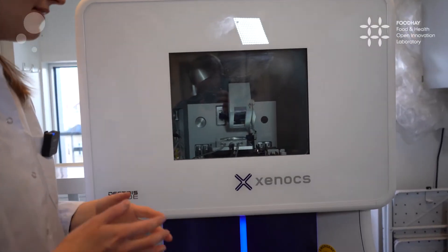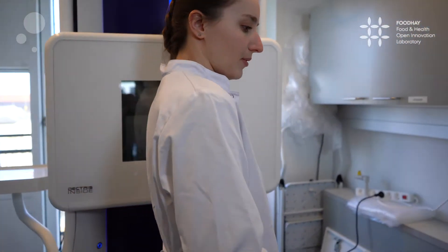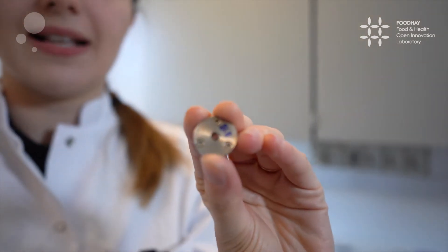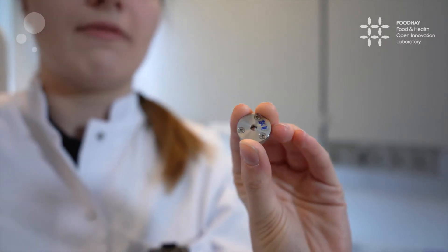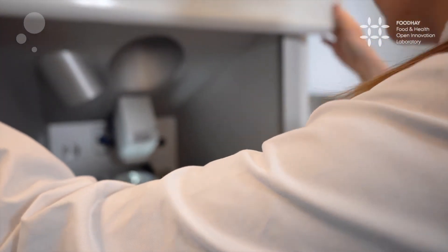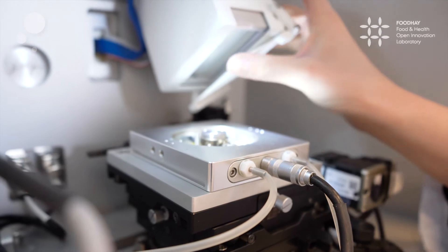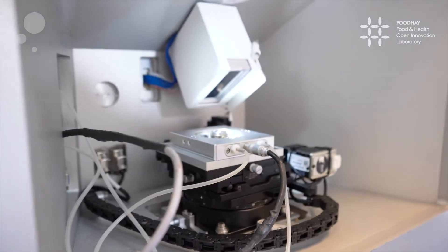To load the samples we have different kinds of sample holders that are most beneficial for the different samples. Solid samples are loaded in these small metal disks. In the middle you can see a window where we place a single-use material that's practically invisible for X-rays, such as Mica or CapTone. Once the sample is loaded, we open the sample stage and place the sample in the middle as such. Making sure that the detector window is open, now we're ready to close the door, induce vacuum, and start our measurement.